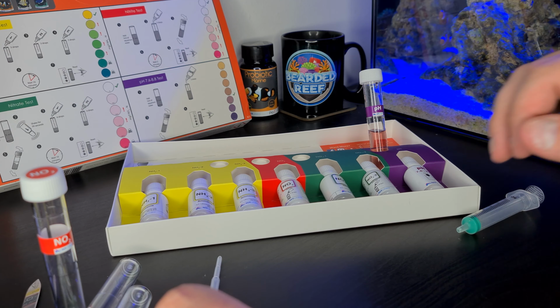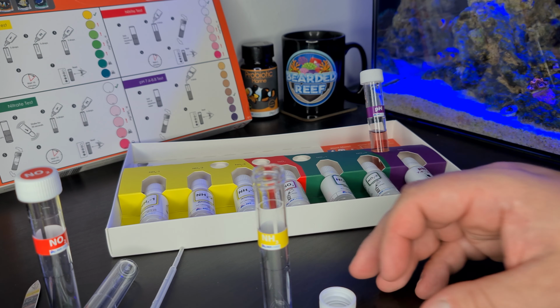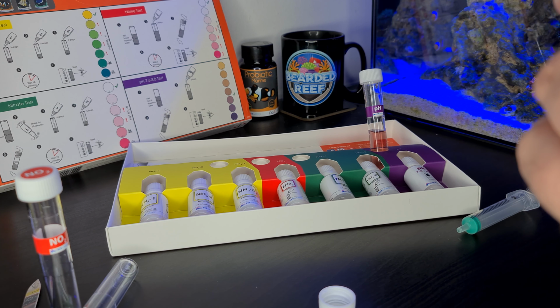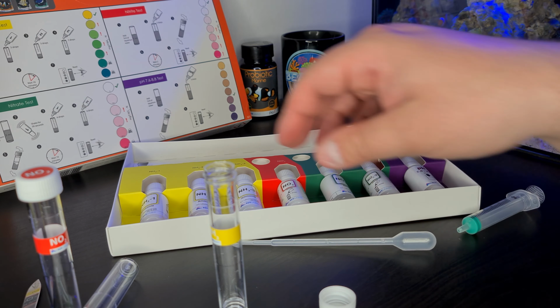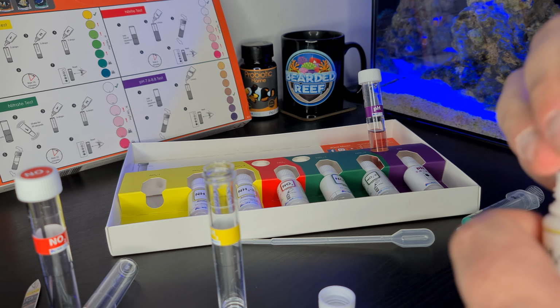Right, let's do ammonia next. Now it's a long wait on this one, but we'll do it anyway. So it's saying add 1 mil of aquarium water, so not much in this one. Okay, so that's 1 mil in there. Just use the little dropper thing that it comes with. So it says 5 drops of each of the solutions. So I'm going to have 5 drops of solution one.